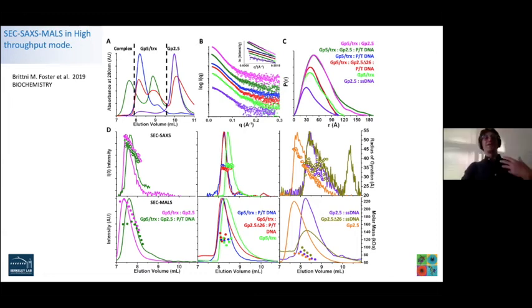Perfect, thank you. I just want to throw you this slide. When you compare the data we're sending to you, it's very important to compare SAXS not only as a curve, because it's not going to tell you so much, but as a P(r) function. You see the complexation. You can confirm that with the UV signal or even the molecular weight that you see right here, the elutions. You can overlay that as I showed in the slides before. So all that information can be used not only as structure information, but as an assay. And I will try to show it on those apoferritin samples if I have time.